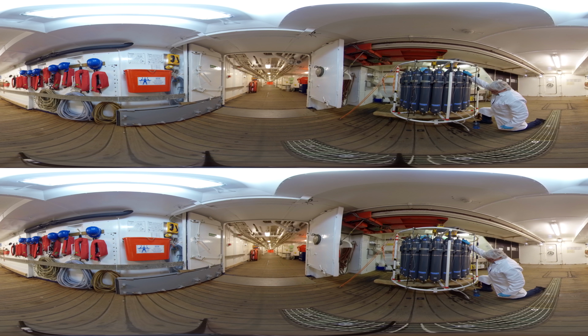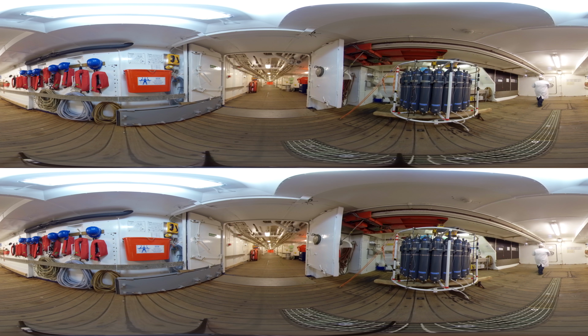The device is generally lowered on a steel cable to the ocean floor, in some cases to depths of several thousand meters. The sample containers open or close at the desired water depth. This makes it possible to bring samples from various depths to the surface. In this way, we can reach conclusions concerning the water composition there. As you can see here, a water sample is being taken for analysis in the lab.